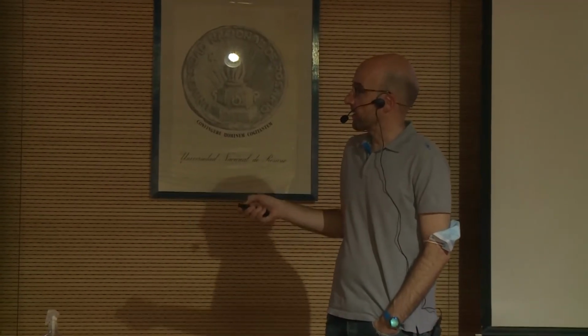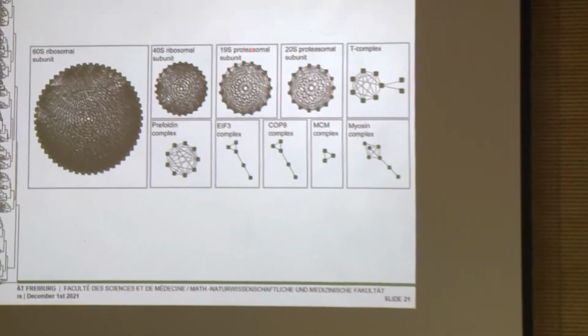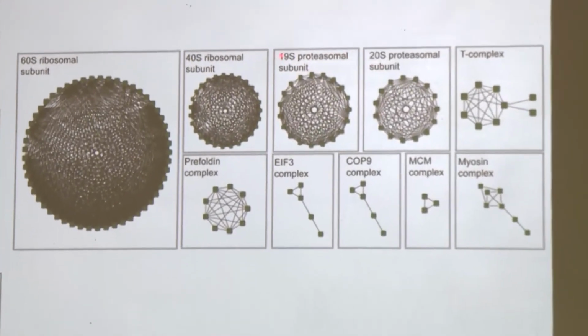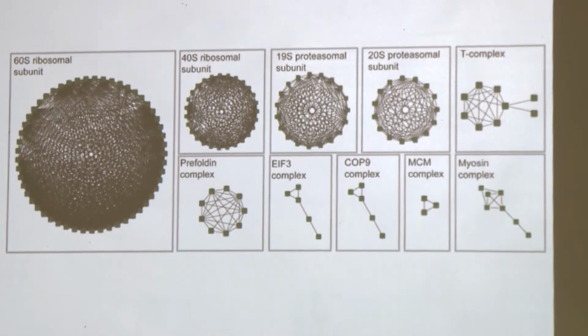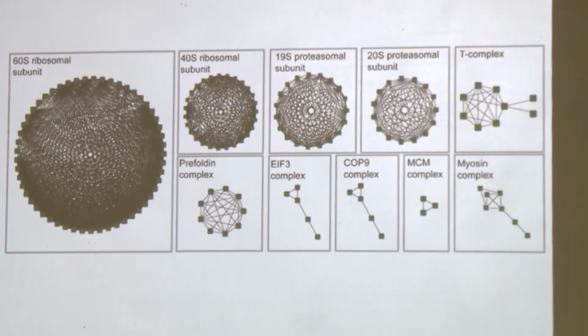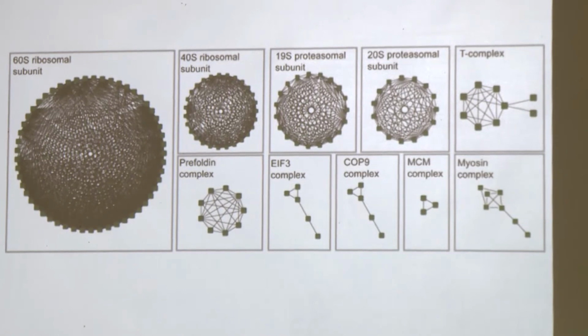And you basically look at the clusters to study what kind of protein complexes you were able to separate. So I showed you the 60S and the 40S ribosomal subunit, but for example, we had a very nice cluster for the proteasome, cap, the core particle, and many different ones, right? So it's really a very robust, very reproducible approach. And then you can study the proteins you are interested in, right?